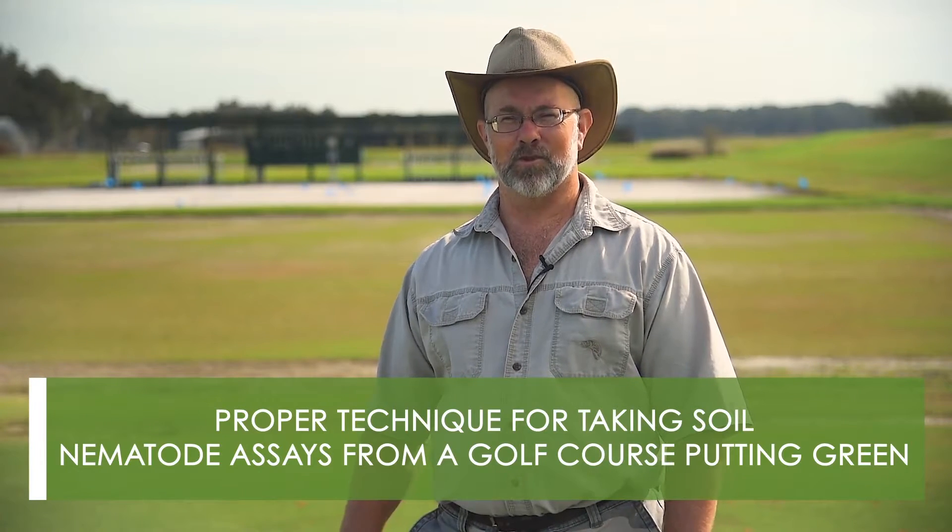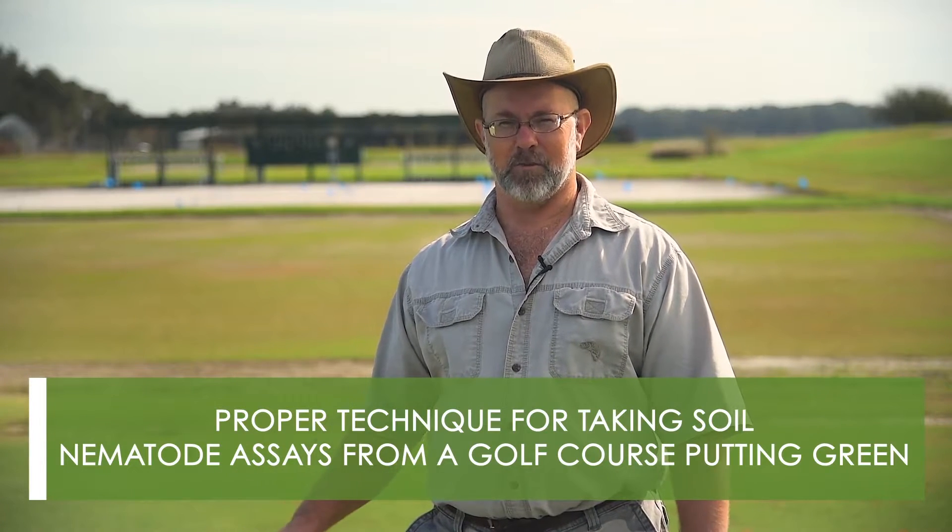Hello, my name is Dr. Billy Crow. I'm a professor of nematology at University of Florida. Today I'm going to be demonstrating the proper technique for taking soil nematode assays from a golf course putting green. If you're taking a sample to send into a lab for diagnosis, it's important to collect a proper sample so that the diagnosis you get back from the lab is accurate.